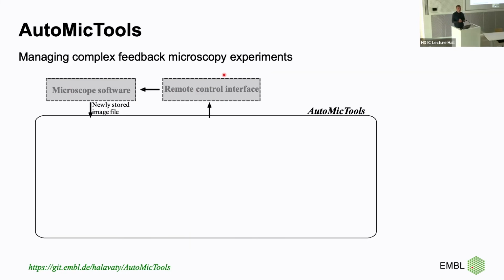For that purpose, over the years I created a toolbox in Fiji, which allows such custom workflows. It has a few predefined workflows, but I see its major strength as a toolbox that, with limited effort, can always be adapted for new applications by defining several modules.